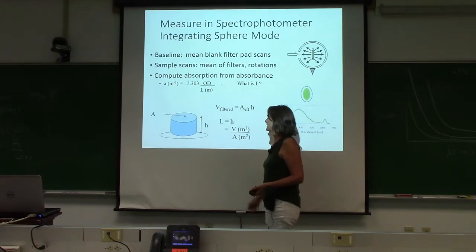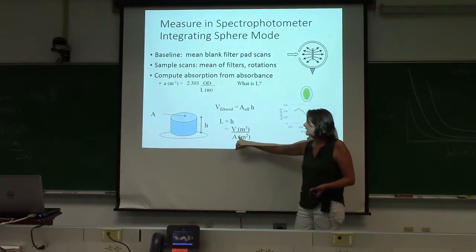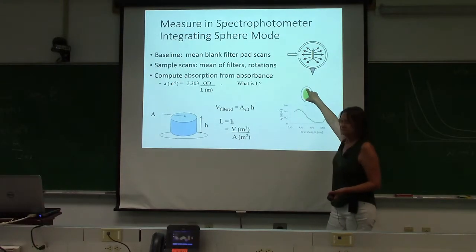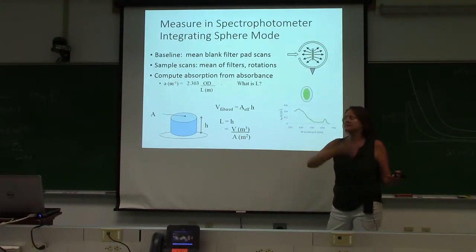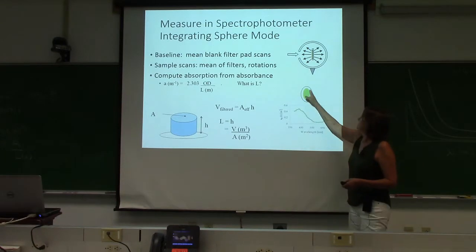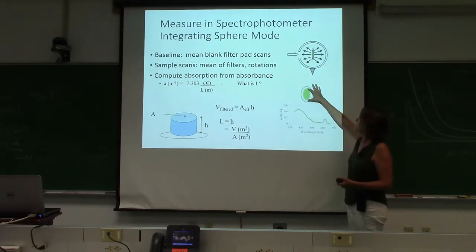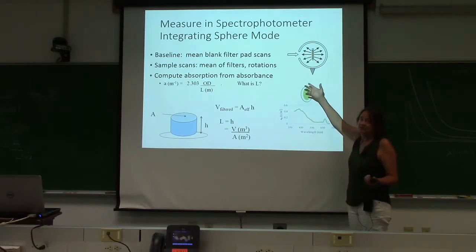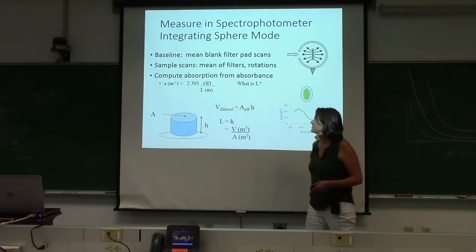So, yes, when you collect your sample, you need to write down your volume, convert it to cubic meters. You need to measure your effective area. I measure it for my particular filter rig, and we've done a series of measurements so I know which filter cup results in which area. I keep track. Because it's variable, you can figure out when you do the calculation, if you have a little bit of error in your radius, it converts, right? It shows up right here. So you can actually propagate your uncertainty there. Okay.